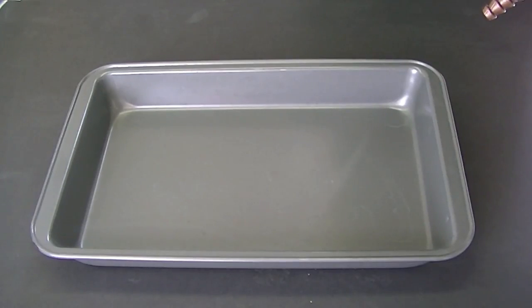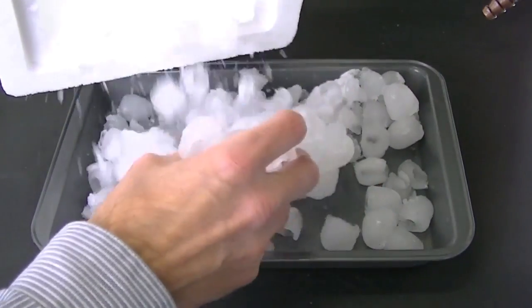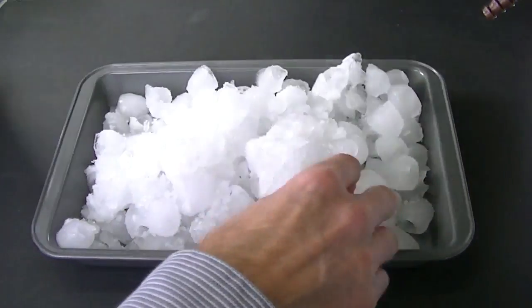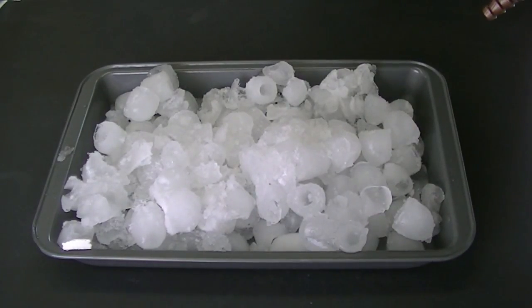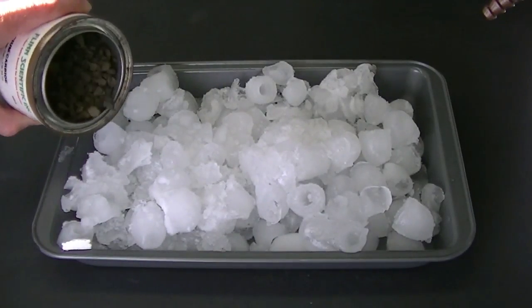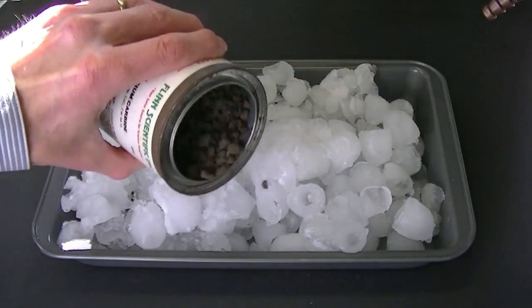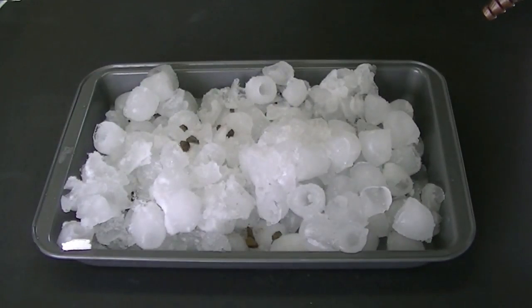The properties of calcium carbide allow for a really neat experiment. We'll fill this pan with some ice. And now we'll add some pellets of calcium carbide. You might notice some fizzing.